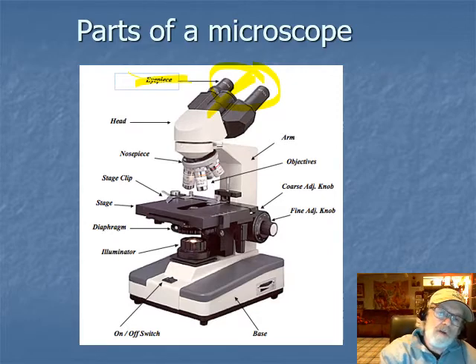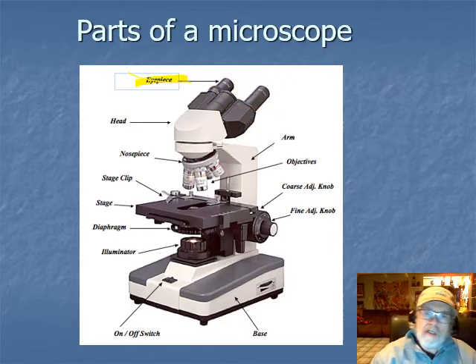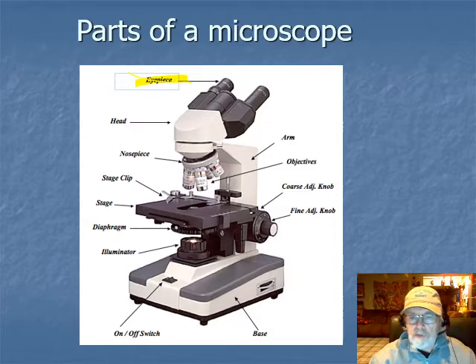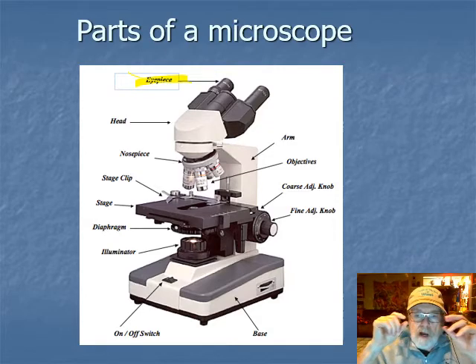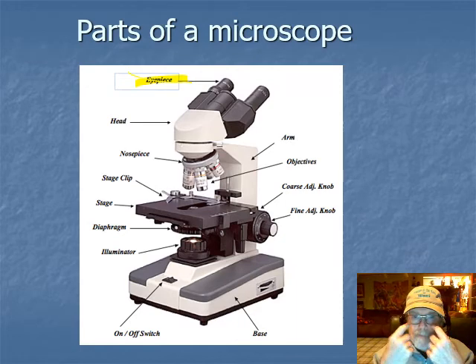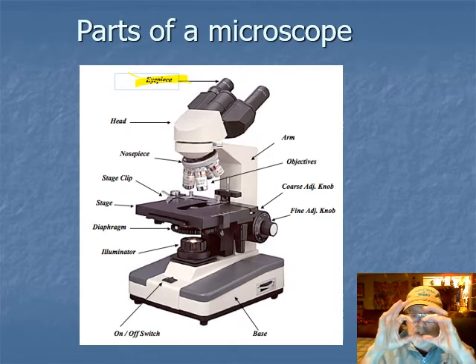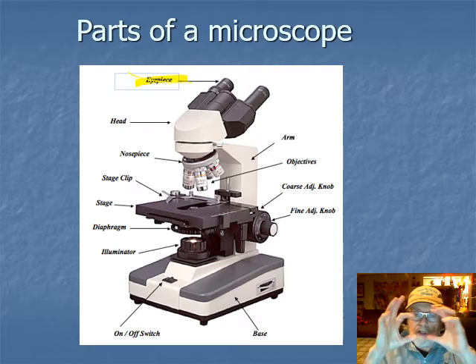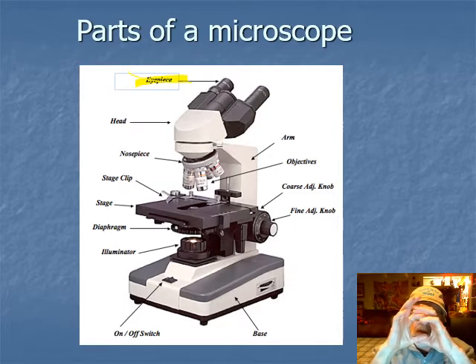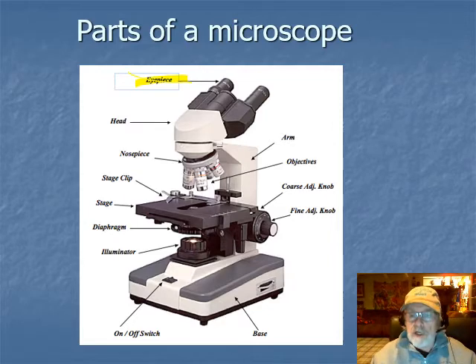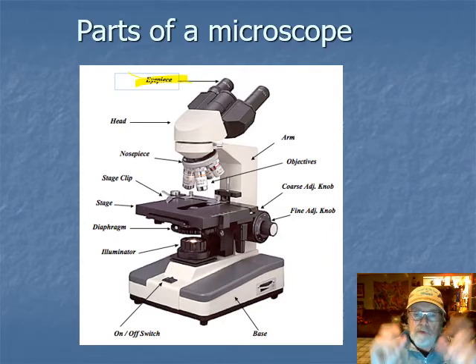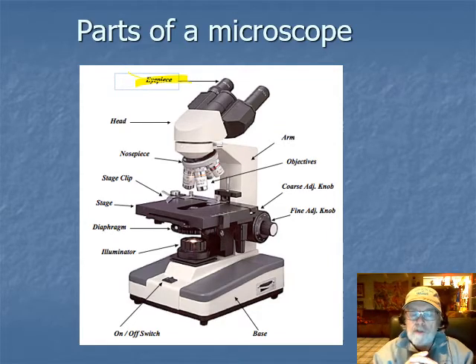The binocular tube is nice simply because you're able to take the eyepieces and move them out or move them close. When you look through the eyepieces you want to see a single round field of vision. If you see two overlapping circles, just move those eyepieces a little bit until the two come together and you have one single circular area of illumination that you're looking at.